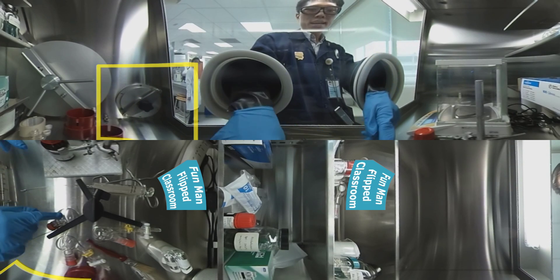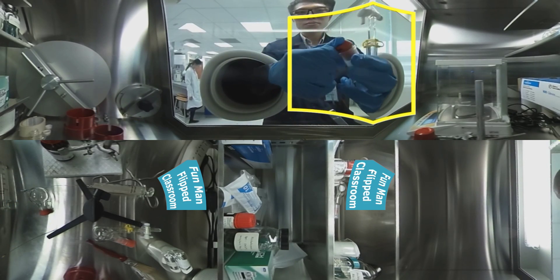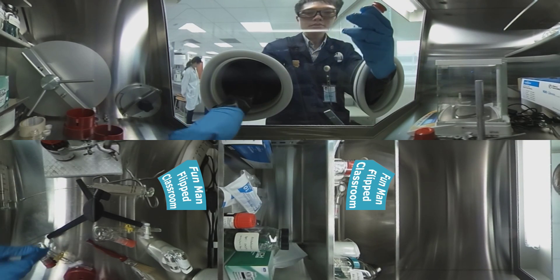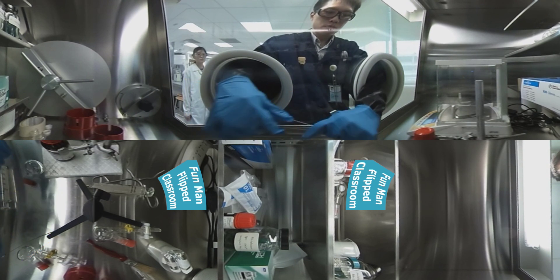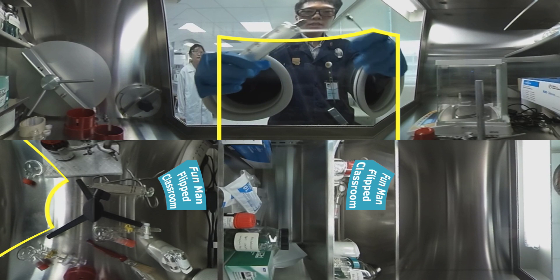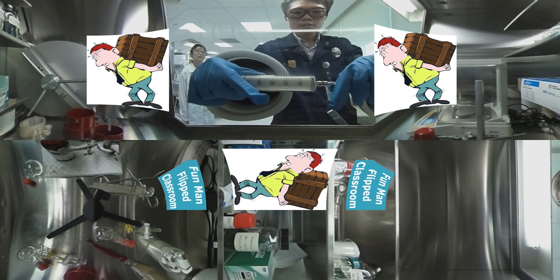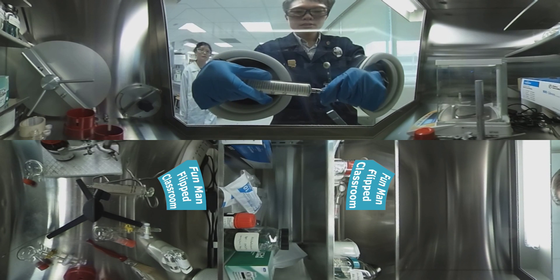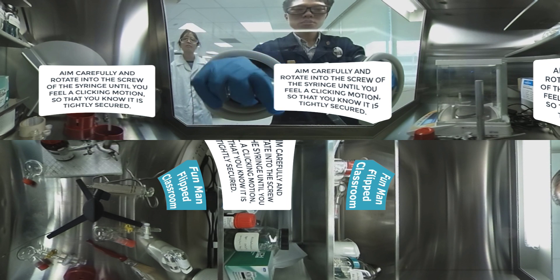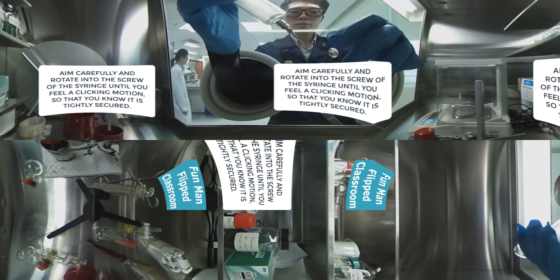Here we have a round bottom flask and a two-neck round bottom flask. Let's seal it up with a rubber septum. I am handling a needle — a special kind that can click into this robust glass syringe. It is heavier and more durable than an ordinary syringe. Pick up the needle, aim carefully, rotate it into the screw, and you sense a clicking motion — that's when it's tightly sealed and secure.